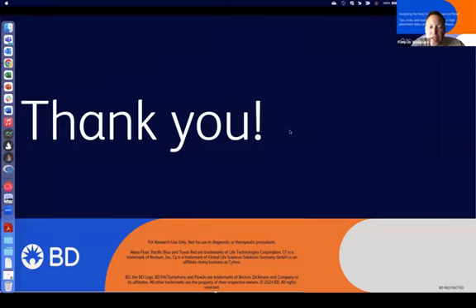Thank you for the interesting presentation. Which algorithm do you advise to correct batch effect when such an effect prevents the use of tSNE and UMAP?